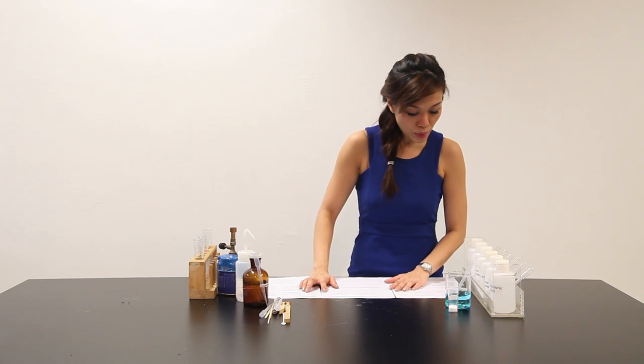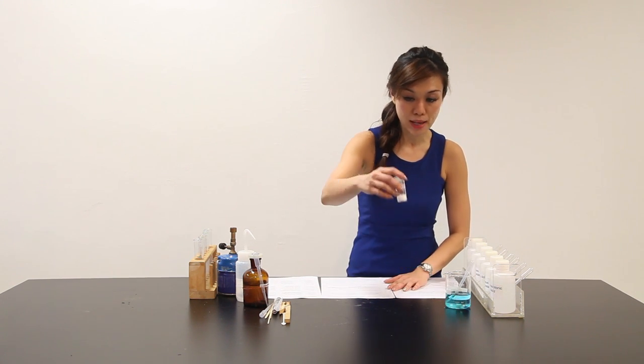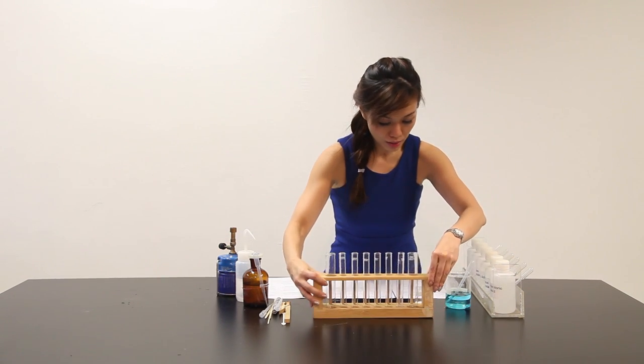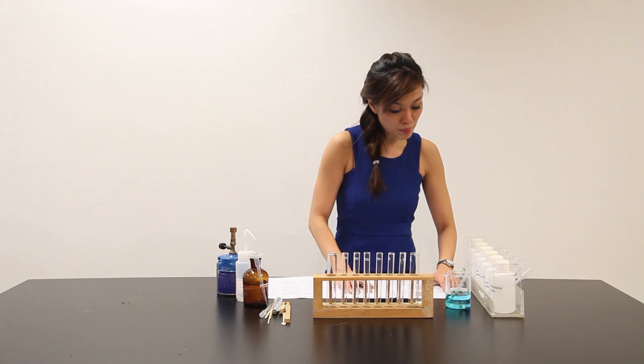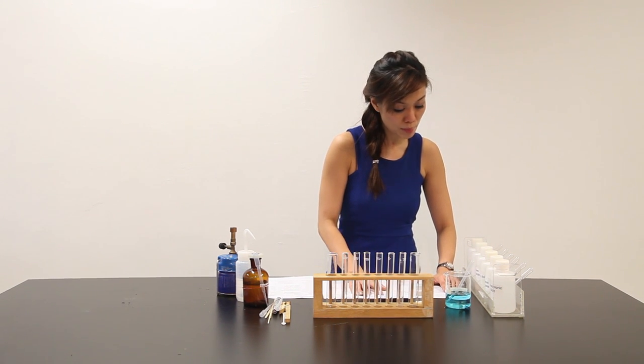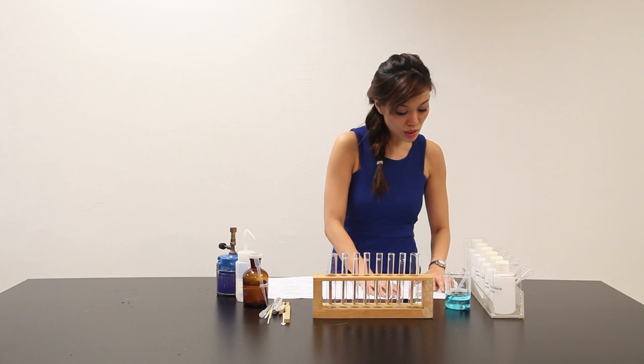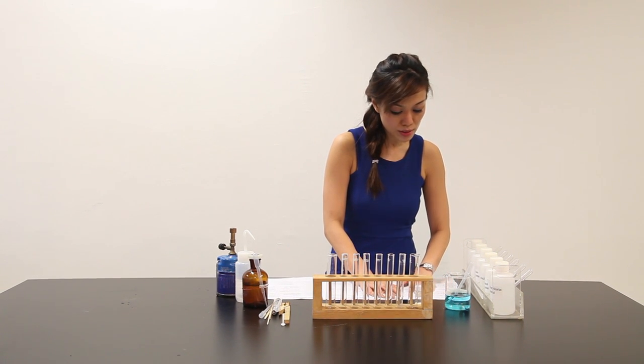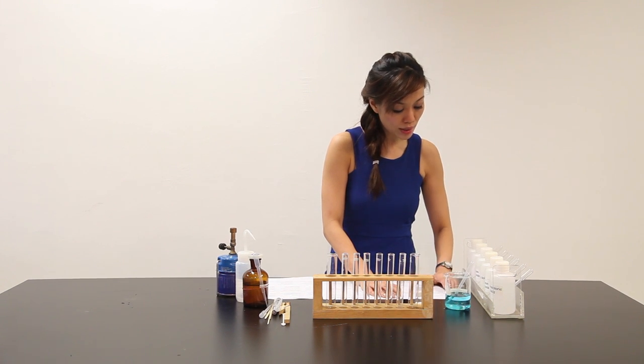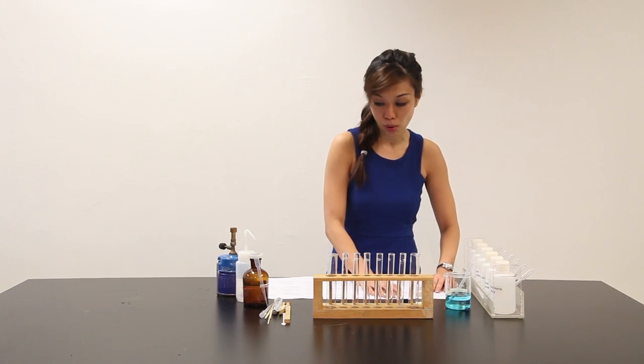The question says you are provided with a sample of solid X. This is sample solid X. So I'm going to put all my tests here right in front of me. The volumes given below unless referring to drops of solution are approximate and should be estimated rather than measured. Using the smaller tip of a spatula, transfer two spatula tips full, about 0.5 gram of solid X into a large dry hard glass boiling tube.